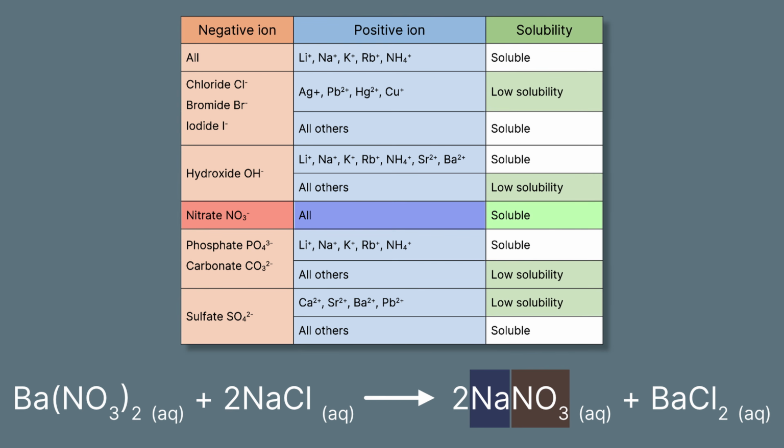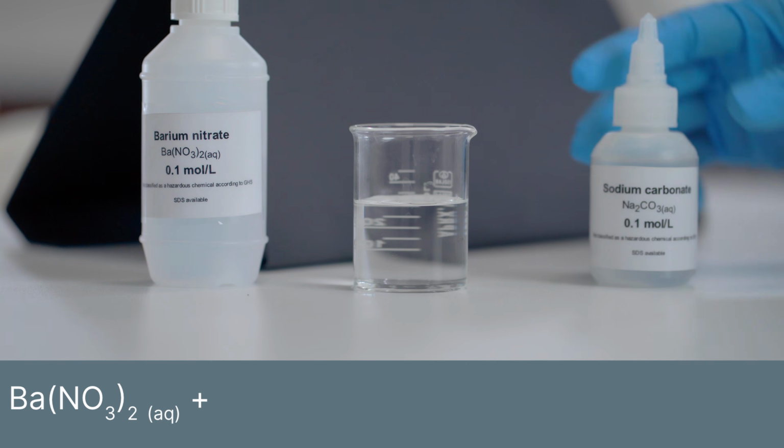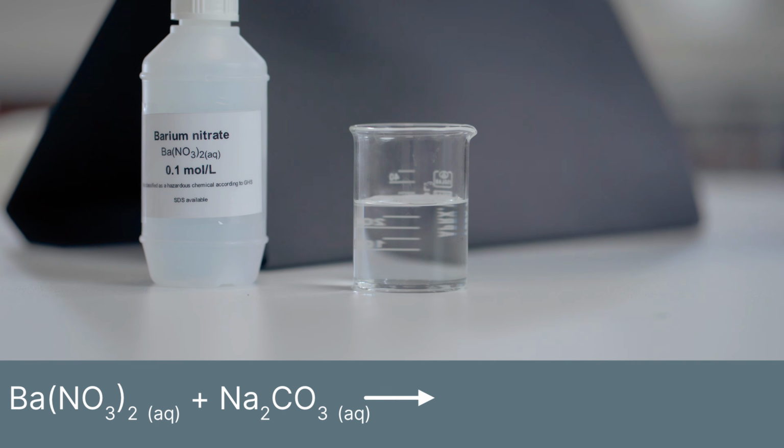So what I did in the lab is I used this table here and I went searching on this thing. Okay, can I find one that I can readily find in the lab that would form a precipitate? I actually looked up carbonates. So I looked on the left-hand side, found carbonate. If it's paired with lithium, sodium, potassium, rubidium, or ammonium, then it will be soluble. Luckily, I didn't pair that. We're going to pair that with barium, which falls into the other category, and therefore low solubility. So theoretically, this should work. So I've swapped out the sodium chloride for sodium carbonate. So let's give this one a shot.